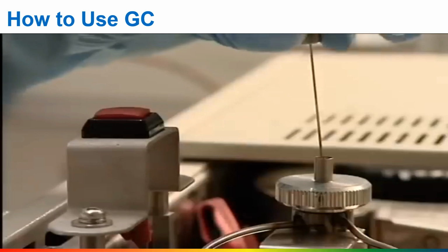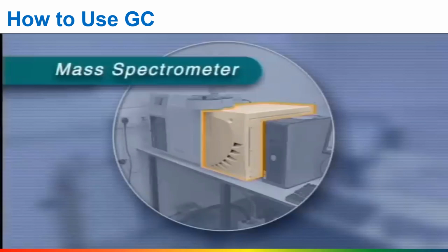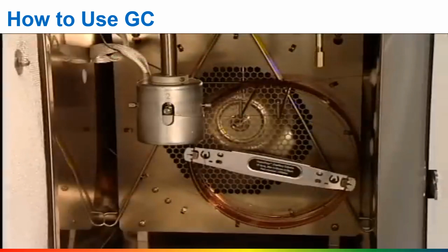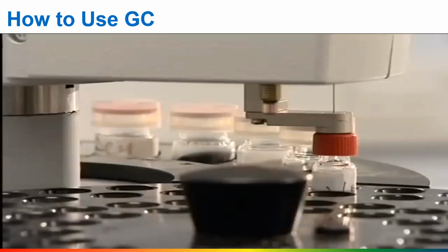In this alternative instrument, the gas chromatograph is on the left, and the detector is a mass spectrometer, which runs the mass spectrum of each component as it comes out of the column. This can be particularly useful when analysing an unknown mixture, as the mass spectrum can help to identify each component. The combined technique is called gas chromatography mass spectrometry, GCMS. This GCMS instrument has an auto-changer for the samples. Many samples can be loaded up and run automatically, perhaps overnight.